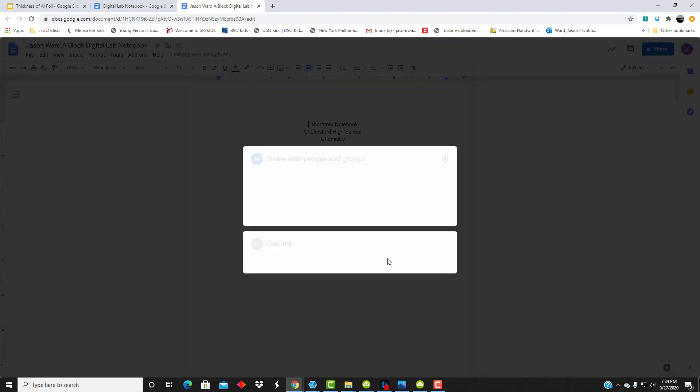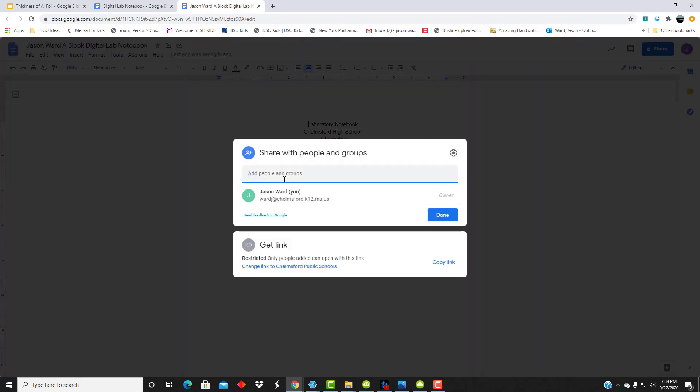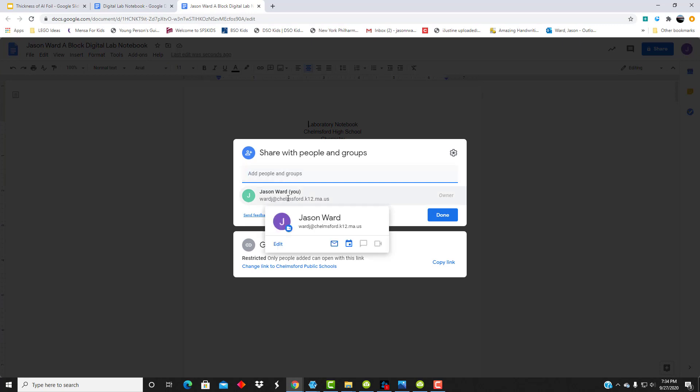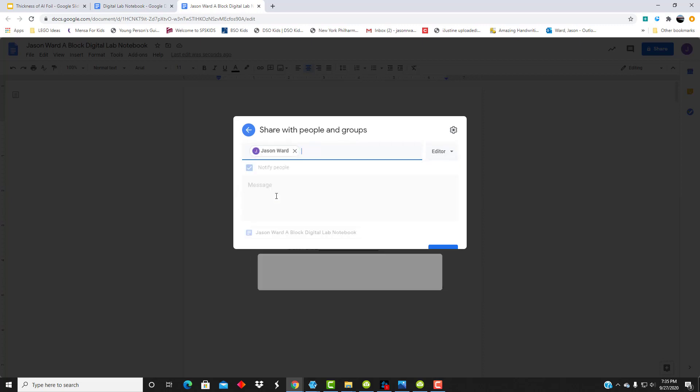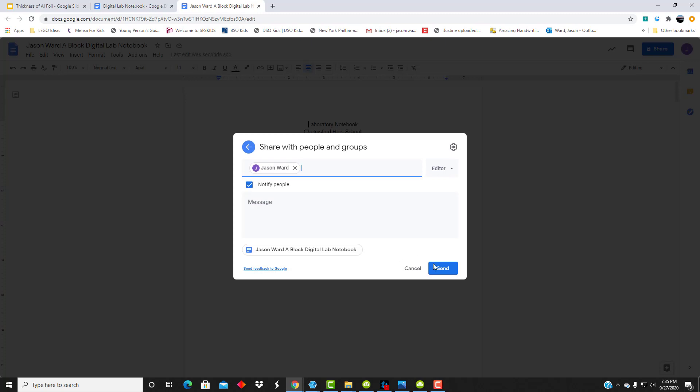Click on the share button, and then you're going to type in my email address, which you can see here. So there's my email address, and then you can just hit send.